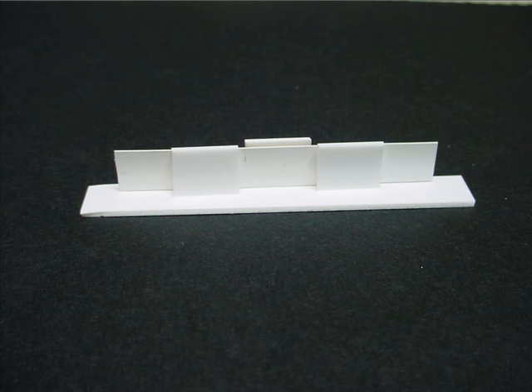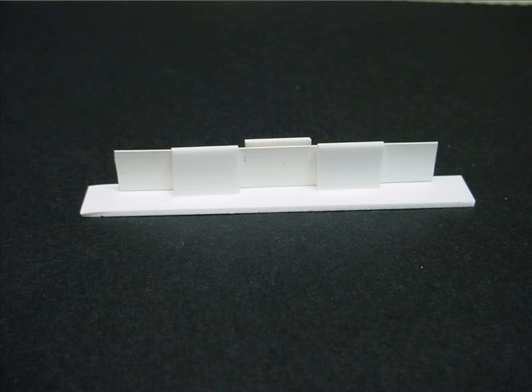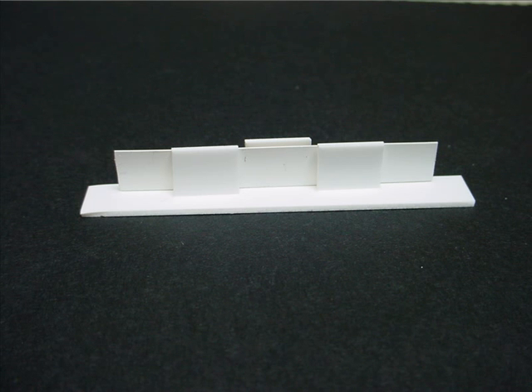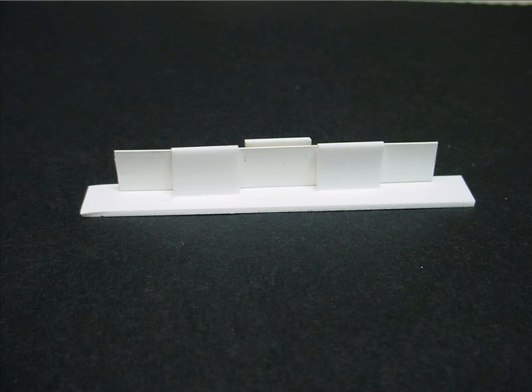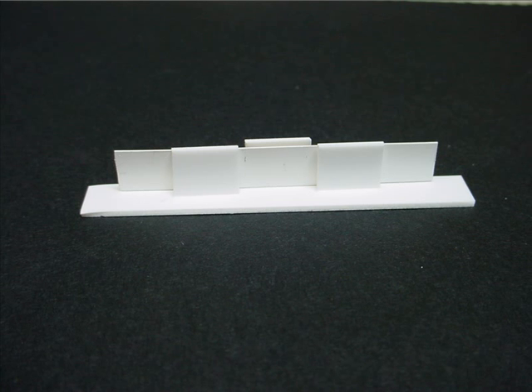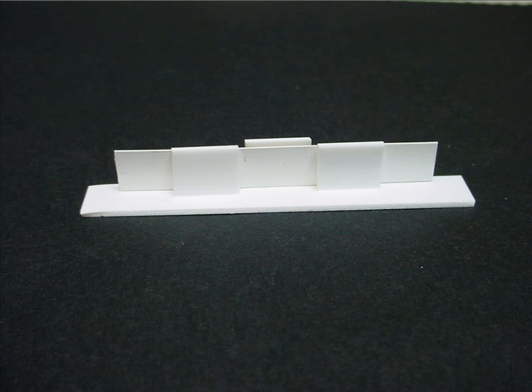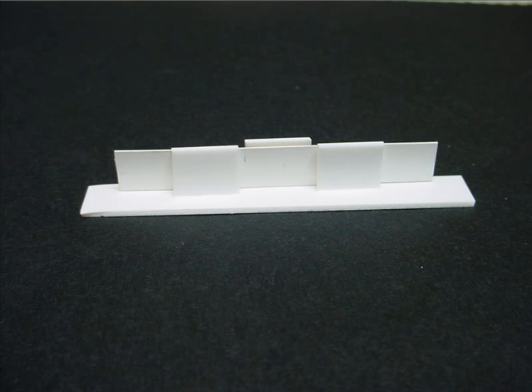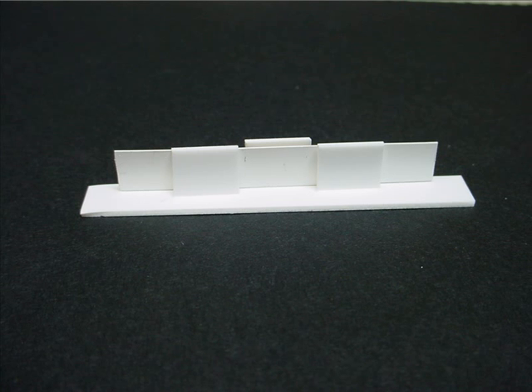Another extraordinary application of the optical dilatometer misura LT is the measurement of the thermal expansion on extremely thin samples, so thin that they cannot withstand their own weight. They must be non-transparent though. This is the picture of a green sheet with a thickness of 100 microns. The material is high grade alumina bonded with PVA, tape cast with the doctor blade technology.